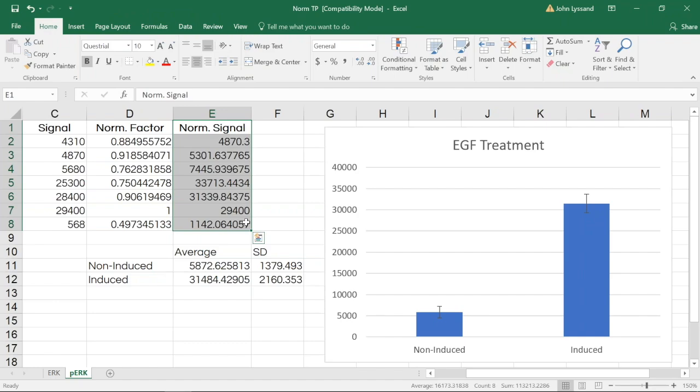Those are the basics of how to accurately and precisely normalize a target of interest using a pan antibody in Image Studio Lite and Microsoft Excel. If you want to learn more about Image Studio Lite, please visit www.licor.com/islight. Thanks for taking the time to watch these lessons and good luck with your own analysis.